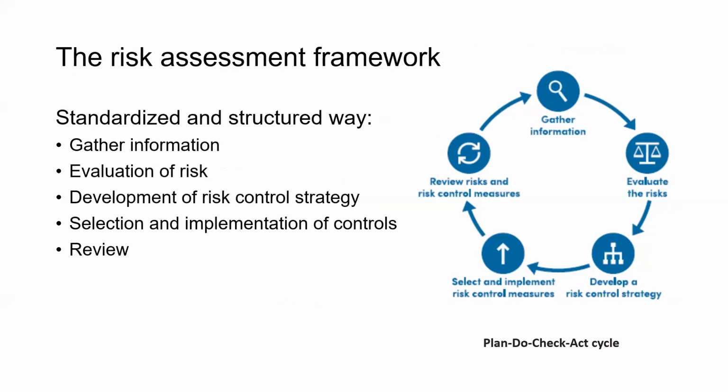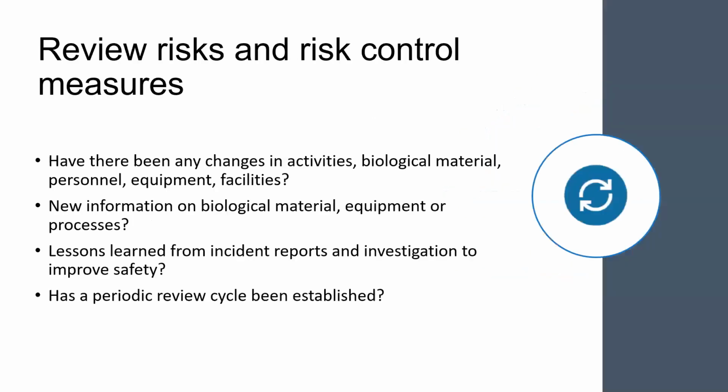We went through all of the steps in the risk assessment framework, from gathering information, evaluating risks, developing the risk control strategy, selecting and implementing risk control measures, reviewing risks and risk control measures, and then finally, that is the piece that we didn't go into very much. I touched on it, but it does circle back around. It's not a linear process.